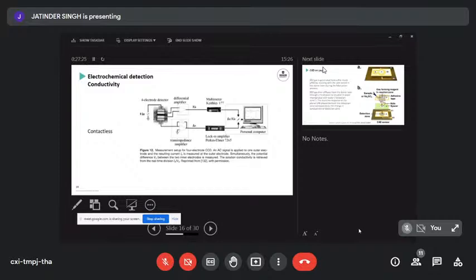So it was a 21-step microfabrication process to first dig a hole into the microchip. The platinum electrodes don't stick well to glass, so you first need a layer of chromium that sticks to the glass to then allow the platinum electrode to stick to the chromium. That all needs to be leveled off exactly into the little hole that they first dug. Then it needs to be covered up with silicon nitride, not the silicon oxide layer. And then you can build a microchannel on top and stick them all together. A 21-step process that took 3 days and a lot of labor.